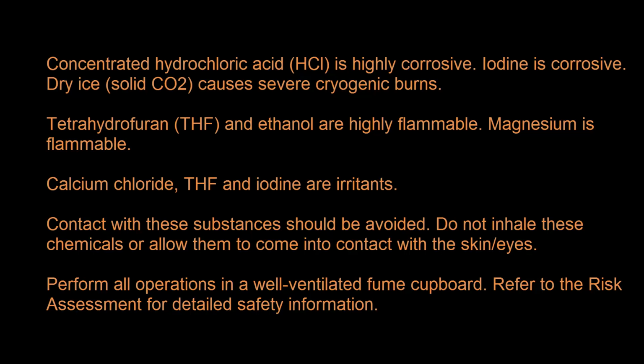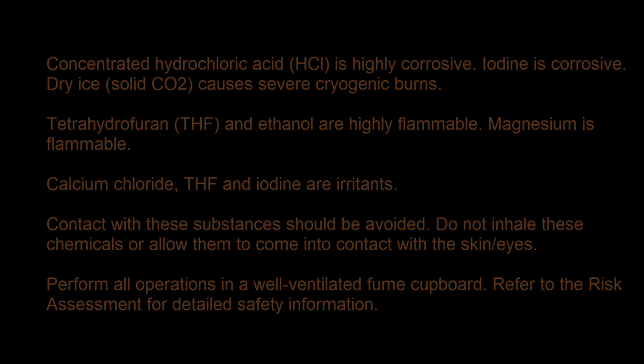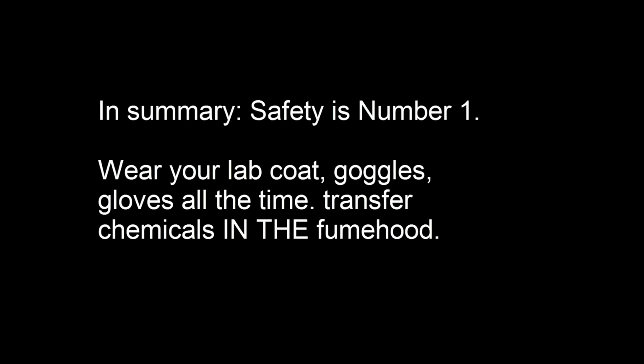THF tends to form peroxides more readily than normal ether, and these peroxides are explosive. And dry ice can cause cold burns. And chloroform-d is carcinogenic, so please do not inhale it or allow it to contact your skin or eyes. And perform all the operations in a well-ventilated fume hood. And of course refer to the MSDS, or nowadays they call it SDS, of the chemicals used for detailed safety information.